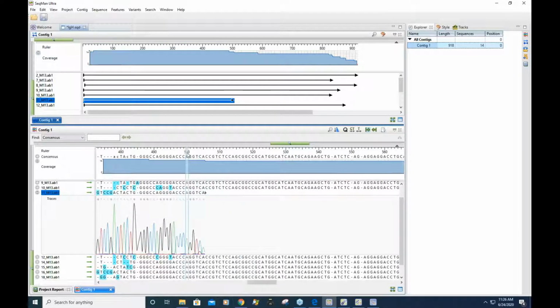Once you get to position 505, you can see the sequence got trimmed by our quality trimmer. If you want to see the section of the sequence that got trimmed back by the trimmer, you see this little gray triangle icon next to the sequence name. You can just drag on that to show you the section that got trimmed back. Here you can see the reason why this section got trimmed back. That's because there's not really any signal at all.